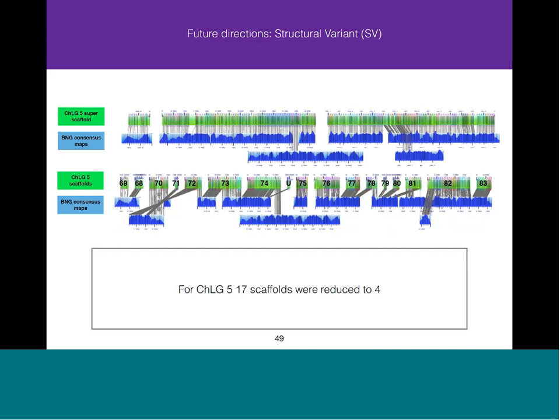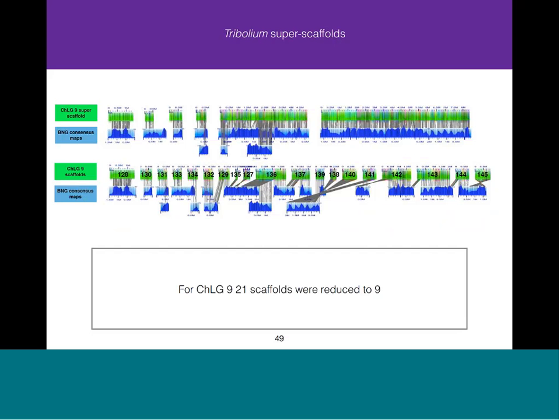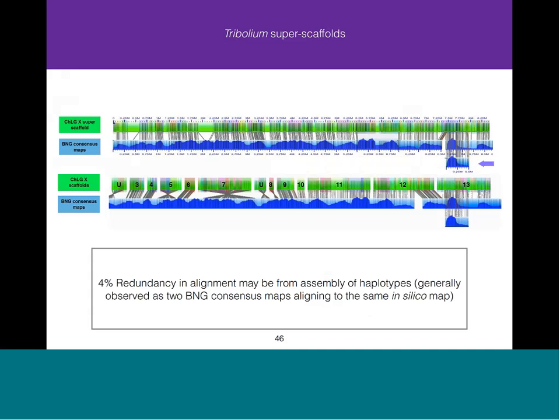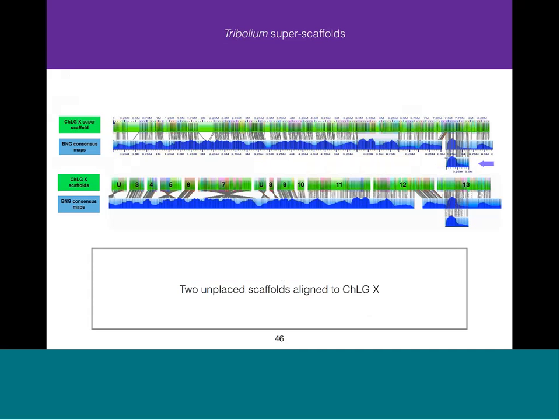Yep. Okay. So here, these colored boxes that are kind of translucent over these scaffolds represent contigs within the scaffold. So it's just sort of multicolored boxes. And you can't see it, but there's no visible gap in this. When you have a visible gap using this kind of view, it would be like this spot right here, bright green, no labels, and no translucent box over it.